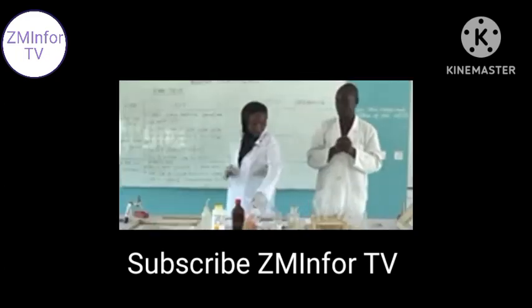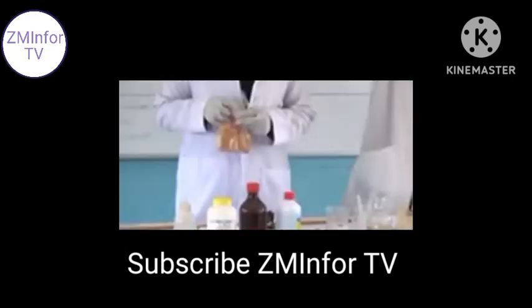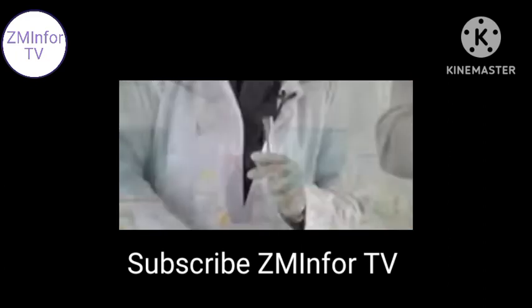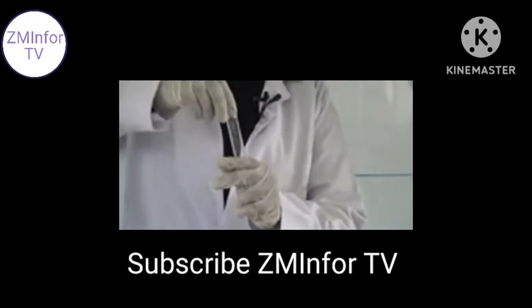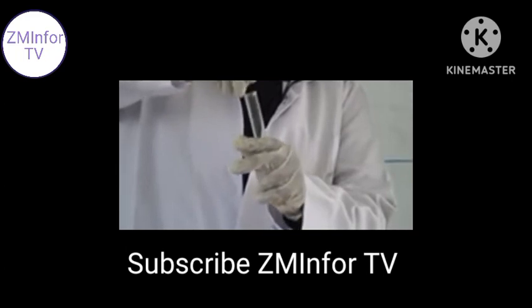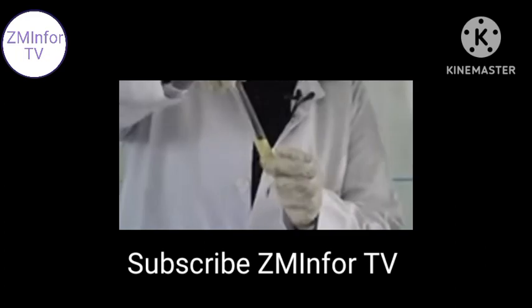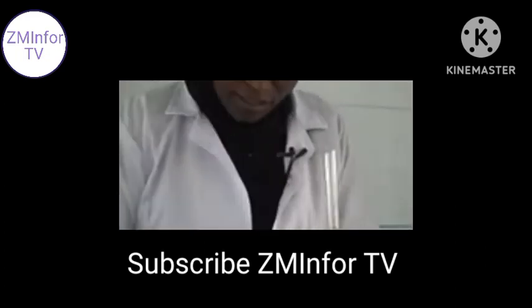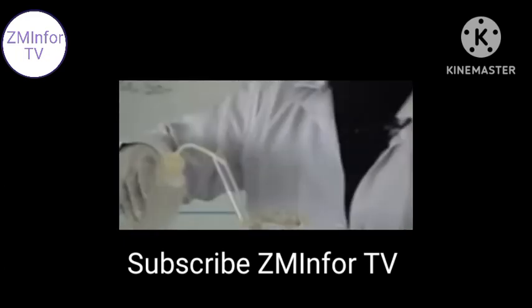Then, I have the bread here. I'll use the test tube. I'll crumble some parts of it. My colleague earlier has said that we use solution in most of our practicals. So this particular one is also going to be in solution. We are going to add water so that we can make it in a liquid form. We have the water bottle. We add water into it.